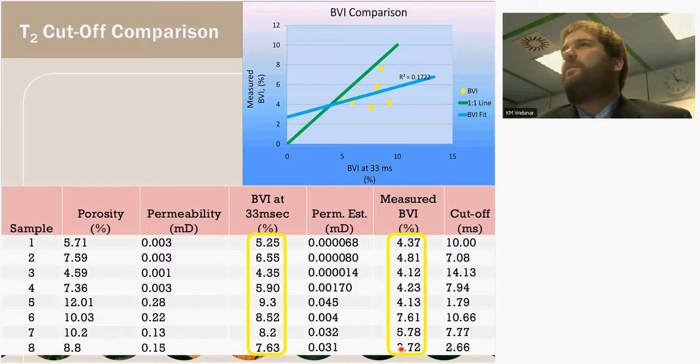And that's going to be important, right? In some instances, free fluid is underpredicted by almost a factor of 5. That can be a substantial impact when you're analyzing your logs. That's why we do laboratory measurements. Of course, as part of the process, we'll measure the permeability of each of these samples, and we'll derive those other permeability coefficients as well.